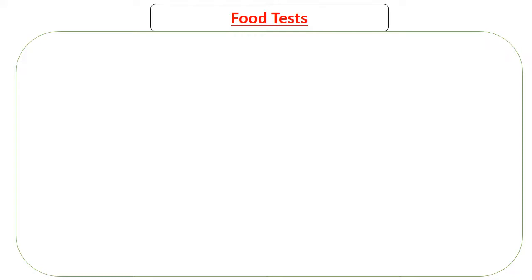What you're going to do here, some of you are lucky, they may be part of your practicals. So the job is just to observe the steps and what happens. That's the whole point of this video. So we're going to start with the iodine test for starch. How do you test if a given food sample has starch? You use what is called iodine solution, and the test is called the iodine test.